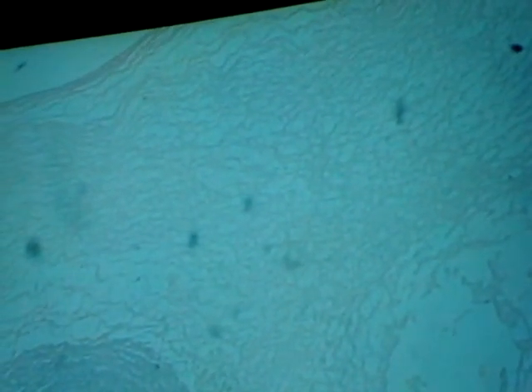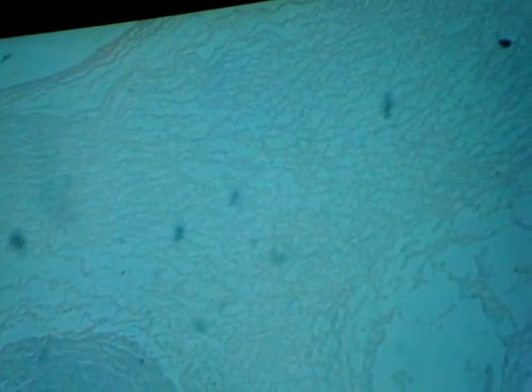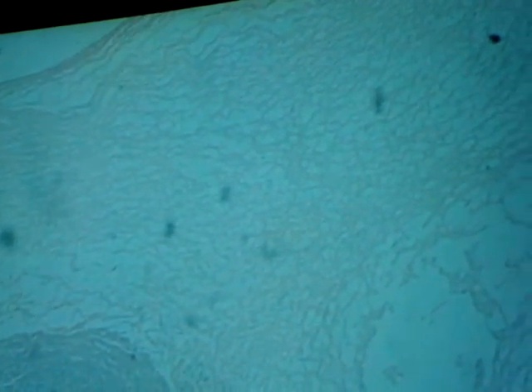Giant thing there. They won't all look this giant, so we'll look at another slide. But that's, again, all you need on this one as well. I think, let me see in here. I can get it so that I can see both, at least one artery and the vein in the same field of view. So where it is now, I can see much more on the top in the microscope itself. So it's possible to see both through the eyepiece.